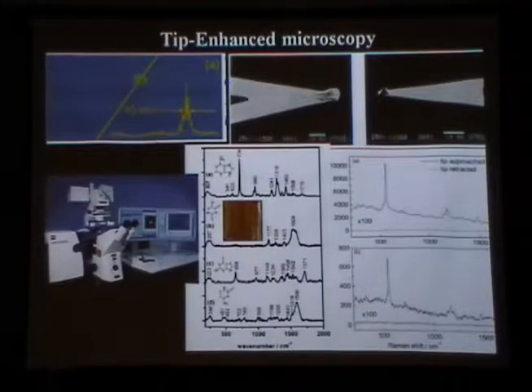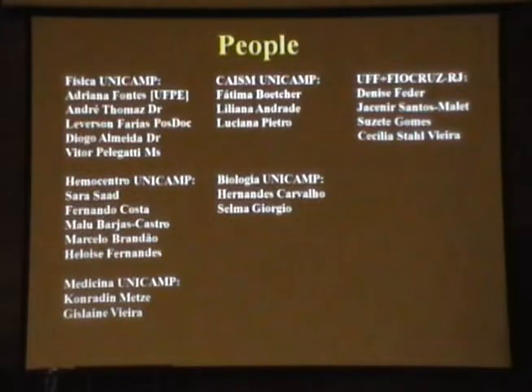It's a contact technique, but you can go all the way to super resolution with this. So if anything is kind of different from the other images, then you can put this one and make this image. Quick question on that.